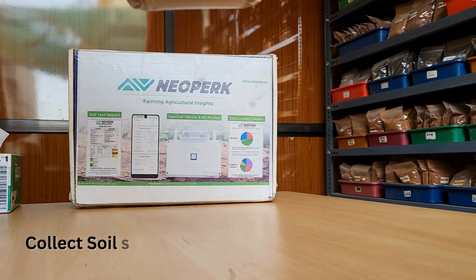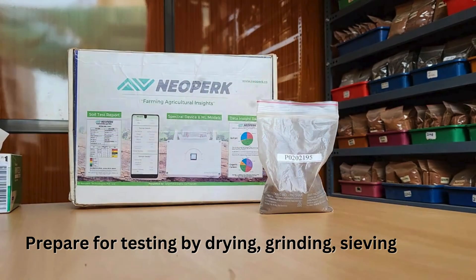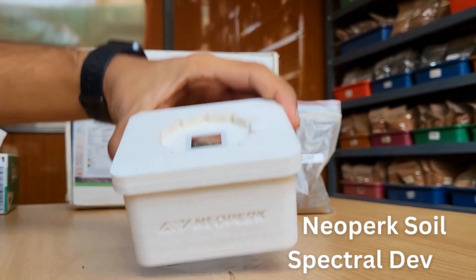Collect the soil sample from the field using our SOP and prepare it for testing by drying, grinding, and 2mm sieving. The prepared soil sample is ready for analysis using Neoperk's Soil Spectral device.